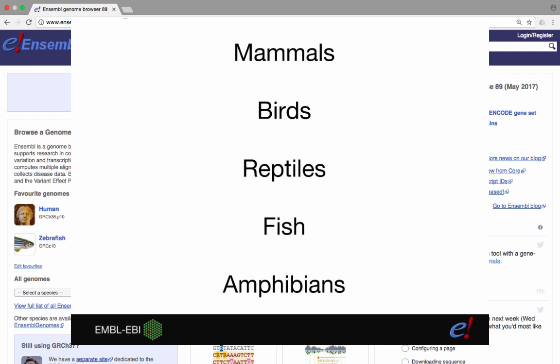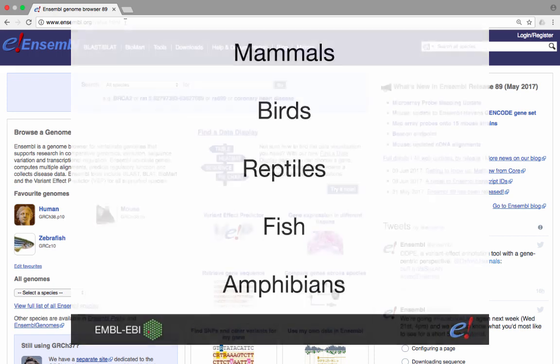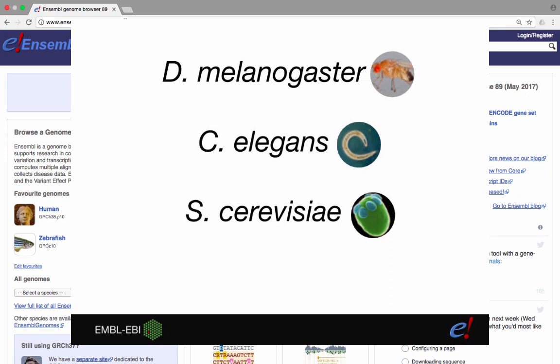Ensembl also presents gene annotation for a small number of non-vertebrate chordate species, such as the lamprey and sea squirt, as well as non-chordate species such as the fruit fly, C. elegans and Saccharomyces cerevisiae, which are species that are important model organisms and are used in our comparative analyses.